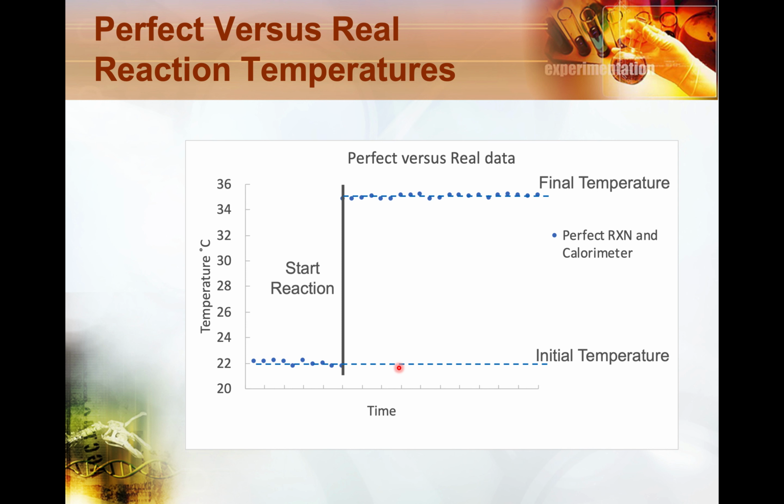The problem, of course, is that you will not get perfect data. One is that it's going to be quite difficult to get as many time points as I've shown here, and as well to get time points in the region around when you're doing the reaction.